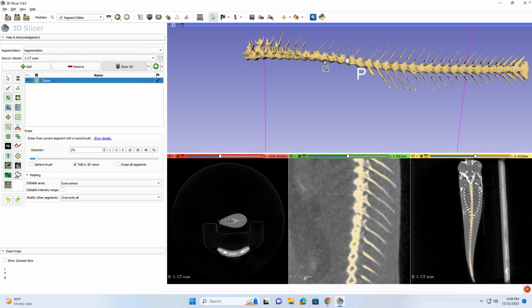There is a way you can move around, and I do not remember right now. When I come back, I'll figure it out. But it's easier once you know it, because then you can just shift around, zoom in, cut those areas. But like I said, we'll just kind of go quickly through that.